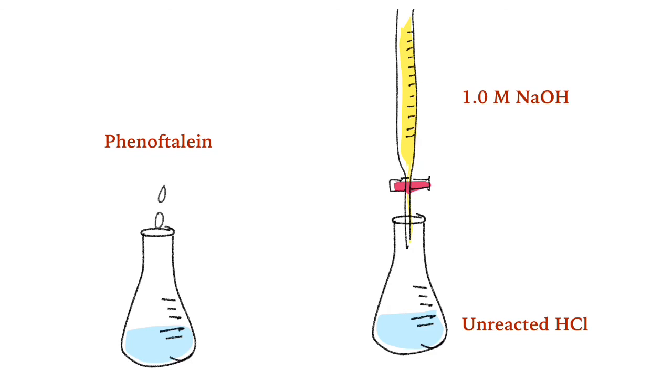After that, you can determine the molar mass of the metal used.